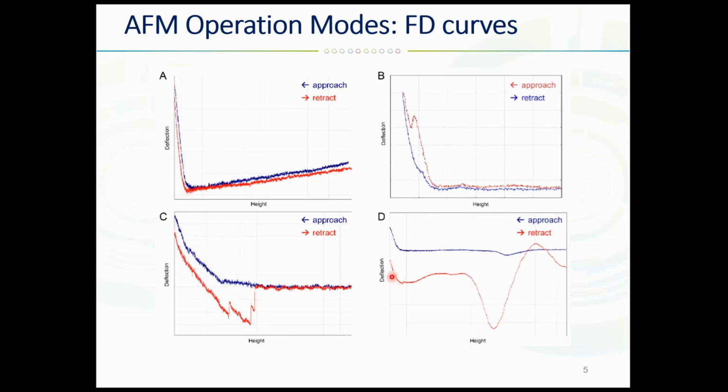we can see a quite unusual transient event in the retraction curve. This can happen by something passing through the laser path during the measurement.